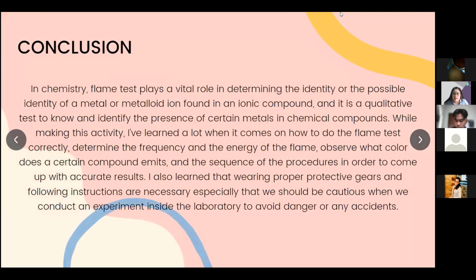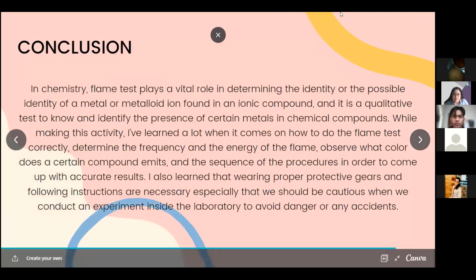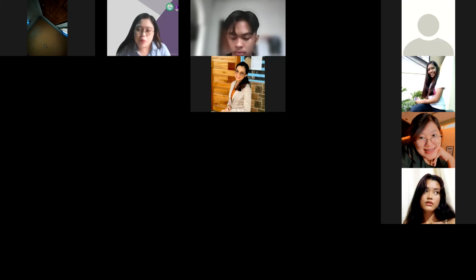Let us check with this one. I-stop share ko siya ha. Kasi yung sa video na pinakita nyo, solution yung gamit, no? You can do that, solution. Kaya lang, kung konti lang yung madala doon sa loop, minsan nahihirapan tayong makita yung color ng flame. Kaya ulit-ulitin natin siya. But meron tayo, pwede din tayong powder or what do you call that? Solid material of these elements. Mas klaro kasi yung kanyang color kapag kaganon.